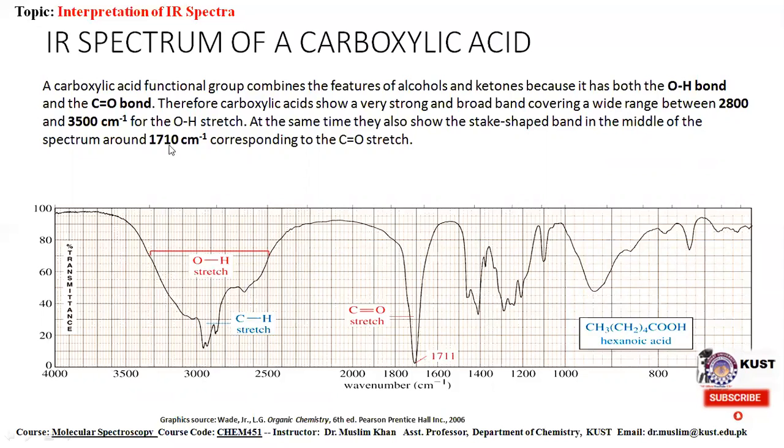At the same time, it also shows the stake-shaped band in the middle of the spectrum around 1710, corresponding to the carbonyl, similar to the ketone.